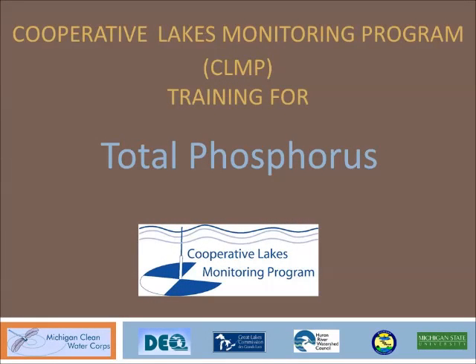This video gives the procedures for how to take a total phosphorus sample for the Cooperative Lakes Monitoring Program, often called the CLMP. The CLMP is a program of the Michigan Department of Environmental Quality and supported by numerous partners. About 230 Michigan lakes participate in the CLMP every year.